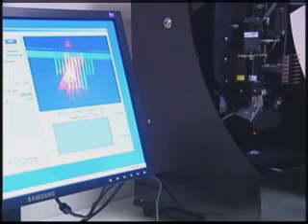In addition, we may actually work with developing sensors where we want to detect a lot of different targets at one time. This tool allows us to spot specific capture molecules that can bind to either cells that we're interested in, viruses, or even some of the DNA and proteins that are associated with those pathogenic organisms, in order to identify them and find out if they're in a sample or maybe even in a person.